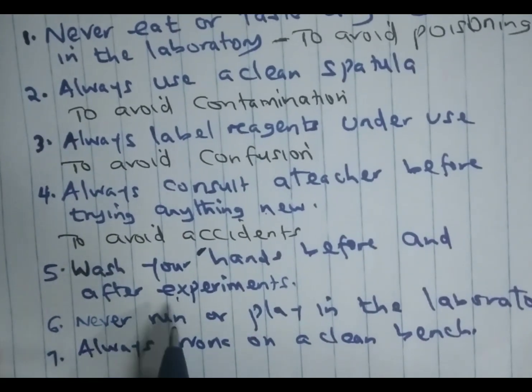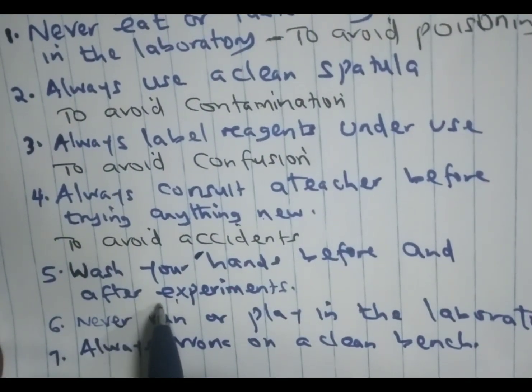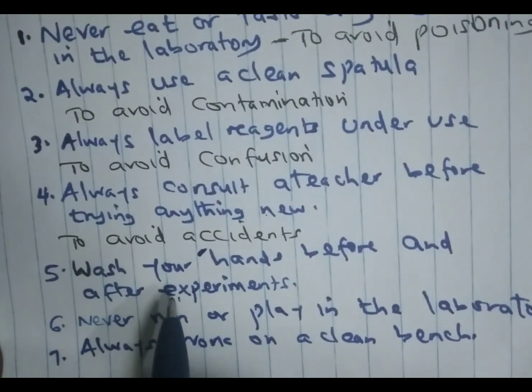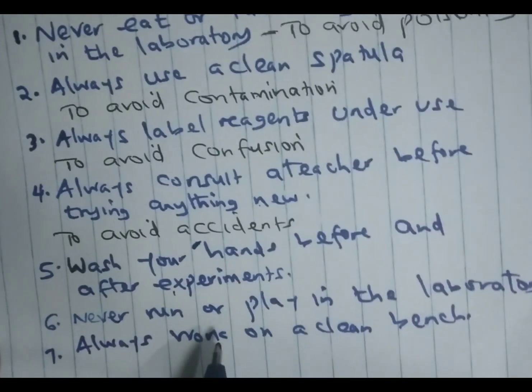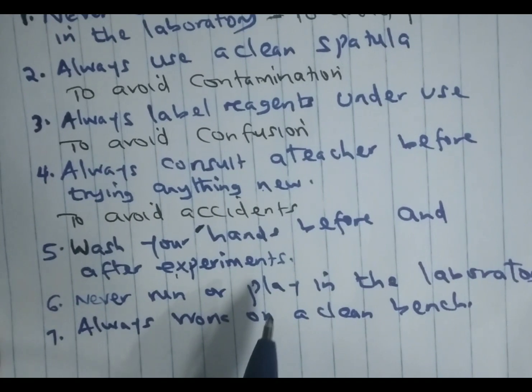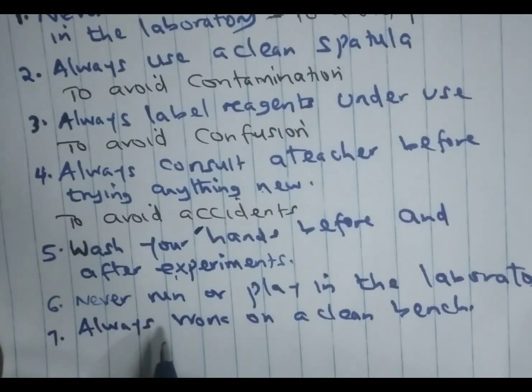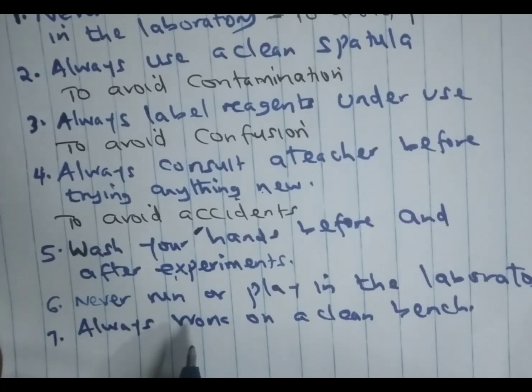Five, wash your hands before and after experiments, and the reason why we do that is because the chemicals we handle are poisonous, and number two, we are trying to avoid contaminating the reagents under use. Number six, never run or play in the laboratory because one can easily injure themselves.